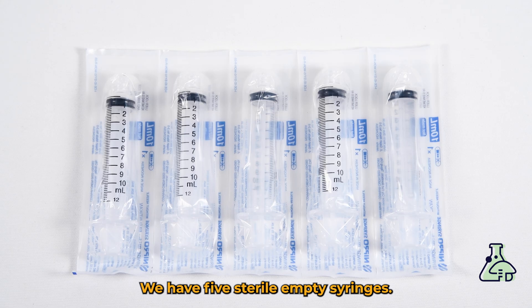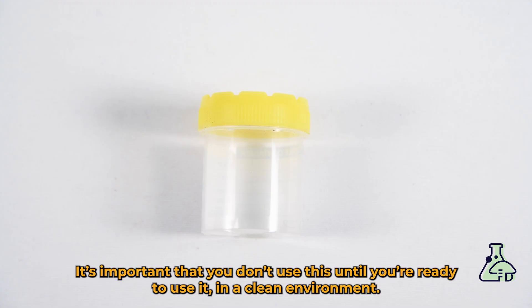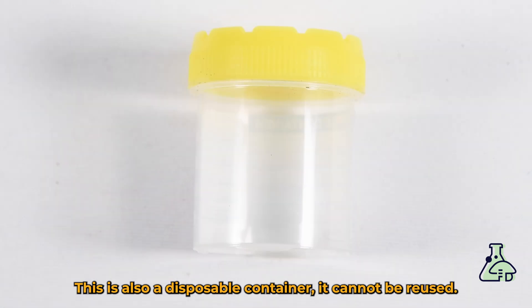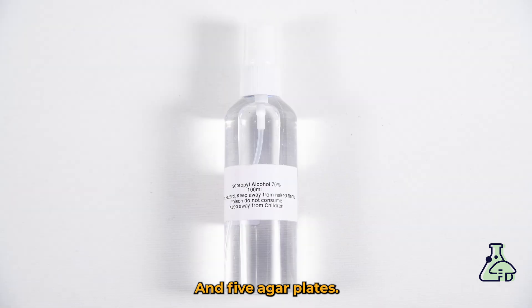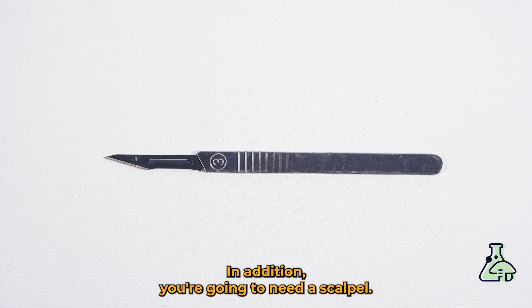We have five sterile syringes, ten sterile needles, a sterile container. It's important that you don't open this until you're ready to use it in a clean environment. This is also a single-use container — it can't be reused. We also have 70% isopropyl alcohol and five MEA biodegradable agar cups.